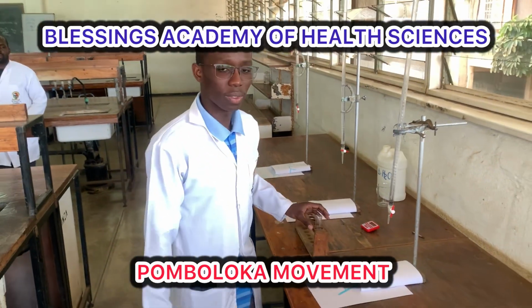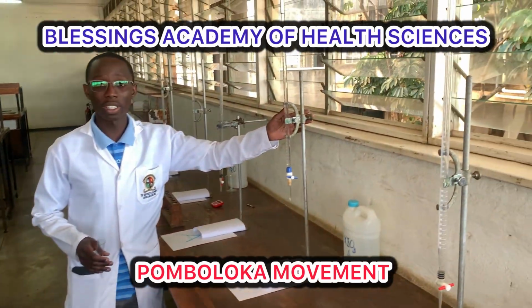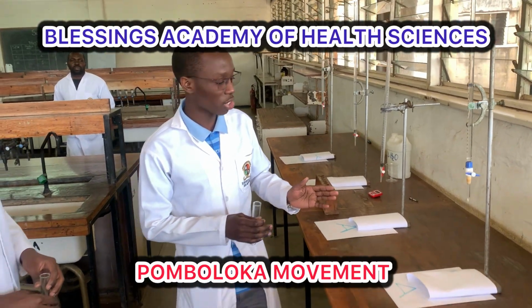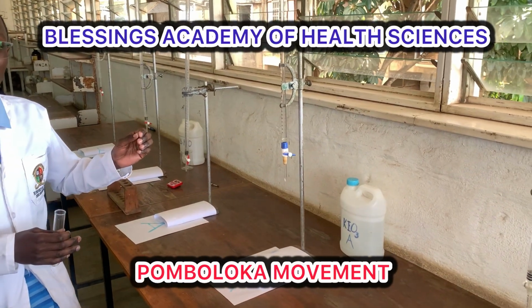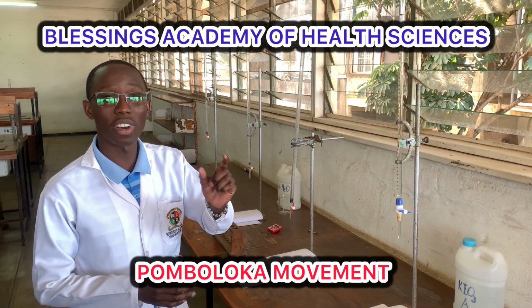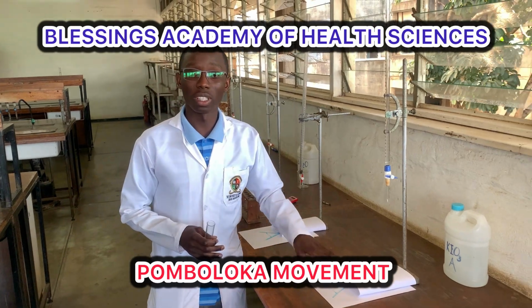All right. So the first procedure, as we can see, we have sample A in this burette. Looking at what we have, in the initial state, we're supposed to get 5 mils of sample A, and then we're supposed to dilute. But in this case, since we already have 5, and we're supposed to have a final volume of 5, we're not going to dilute the first 5 mils we're going to get of A.